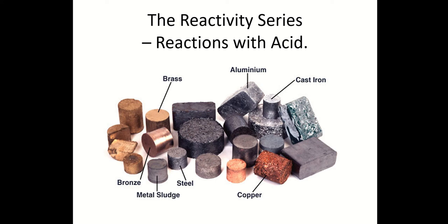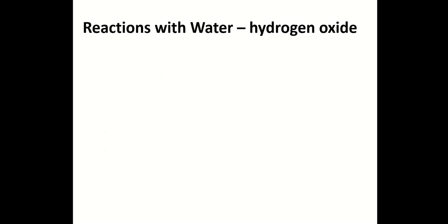In this video, we're going to take a final look at some of our reactions of the reactivity series, and we're going to look at the reactions with acid. Now, just before we do that, let's do a little reminder of what we've seen in the last couple of lessons.